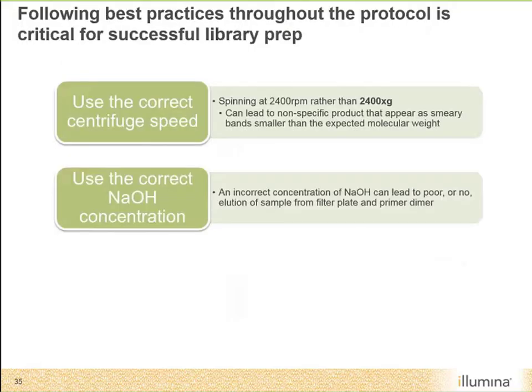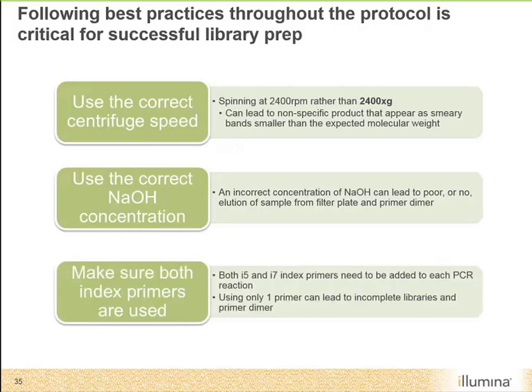Other things to keep in mind is that we are using the correct sodium hydroxide concentration. It's pretty important for proper elution off the filter plate. And that we're using both sets of index primers. You need to use both an orange and a white capped index primer tube, otherwise you won't have a complete library. So we want to make sure that we're using two primers.